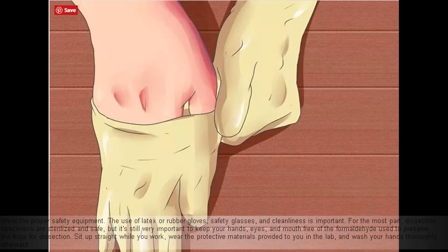Wear the proper safety equipment. The use of latex or rubber gloves, safety glasses, and cleanliness is important. For the most part, dissection specimens are sterilized and safe, but it's still very important to keep your hands, eyes, and mouth free of the formaldehyde used to preserve the frogs for dissection. Sit up straight while you work, wear the protective materials provided to you in the lab, and wash your hands thoroughly afterward.